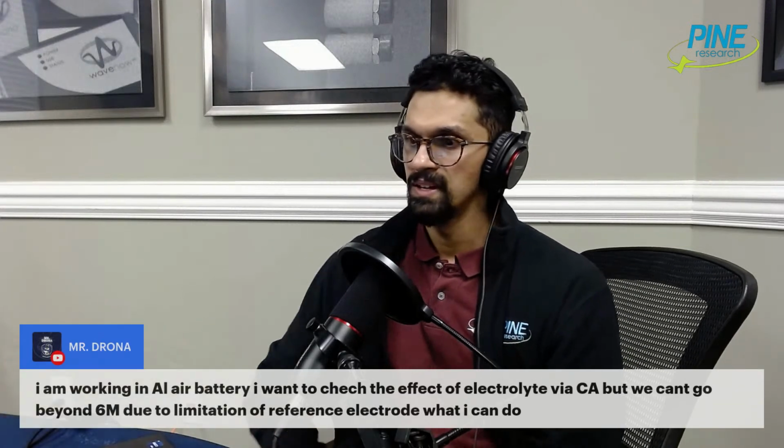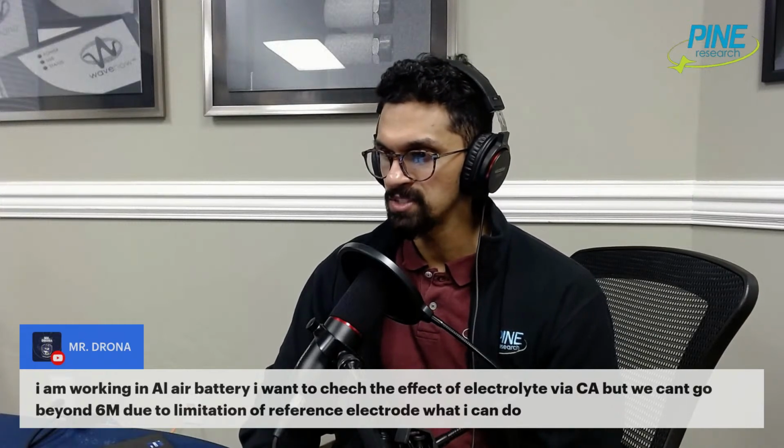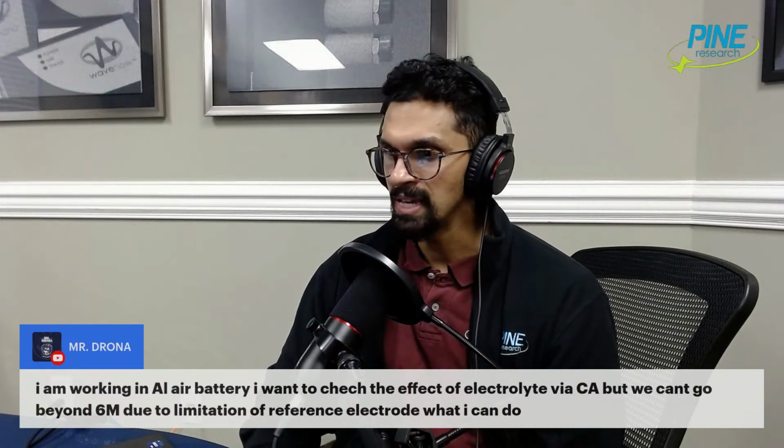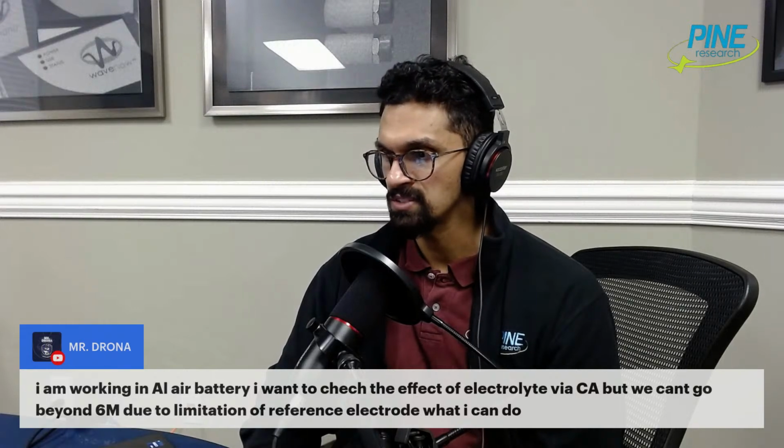Now, let's see. The next question is from Mr. Drona. I'm working on aluminum air batteries. I want to check the effect of electrolyte via chronoamperometry, but we can't go beyond 6 molar due to limitation of the reference electrode. What can I do?